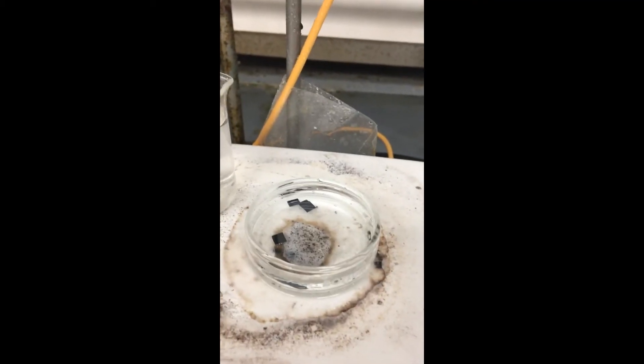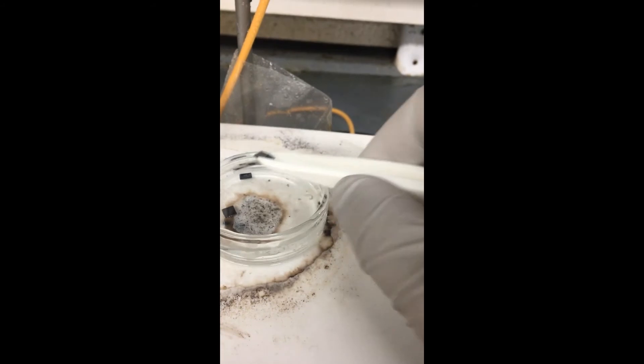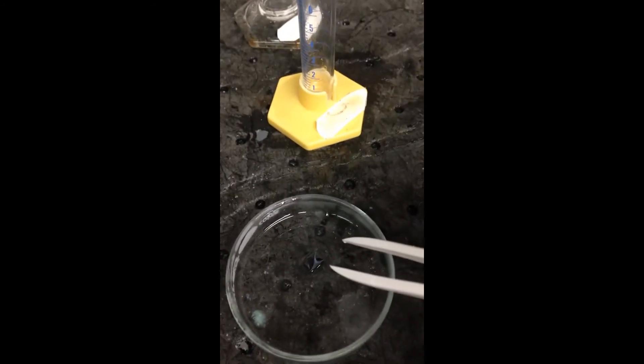An hour has passed and now we're going to take our wafers out. Using the Teflon tweezers, we're going to very carefully take them out and put them in this glass petri dish.